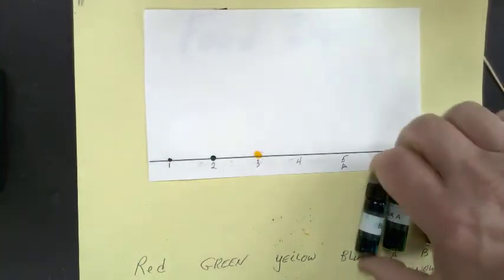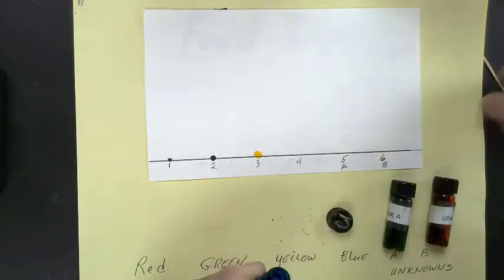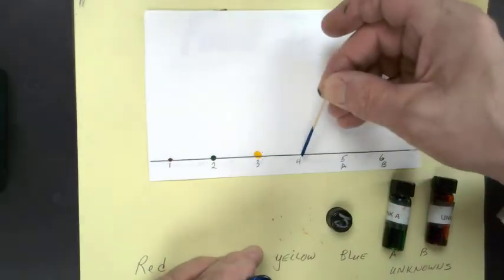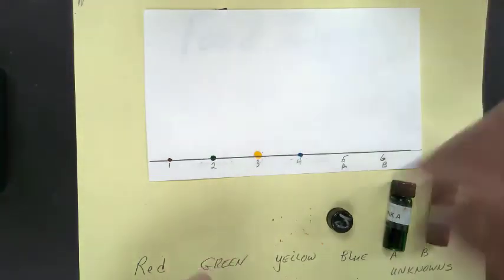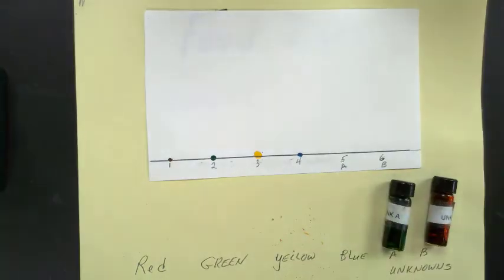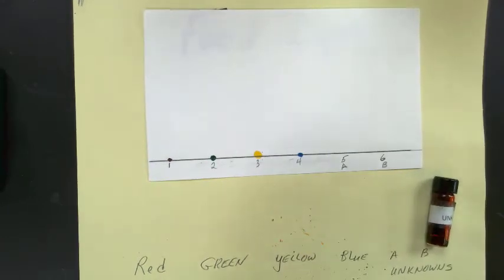You don't need a lot of sample, but you do have to have your sample. And again, if you forget the numbers, you can get them from the book. I probably should use both ends of my toothpicks, but I don't want colored fingers right now.